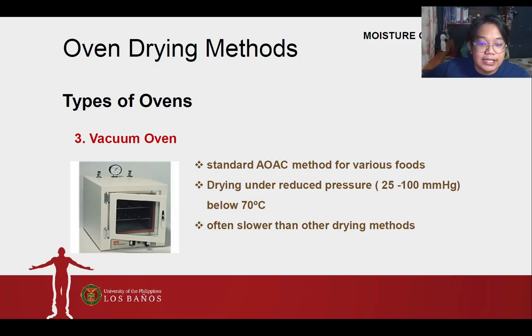So, it applies the reduction of pressure so that yung temperature natin ay below 100 degrees, which is below 70 degrees pa dito. Pero, relatively lower or slower siya, yung operation time niya compared to others. Okay?